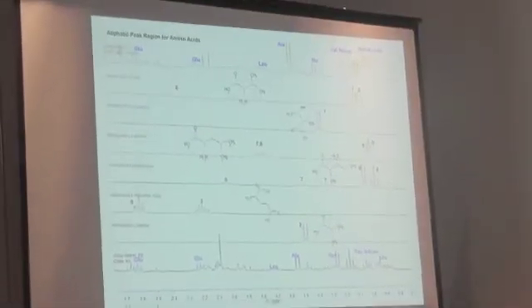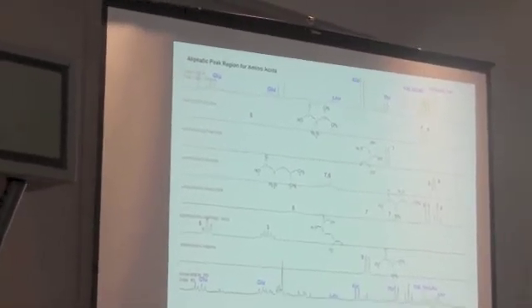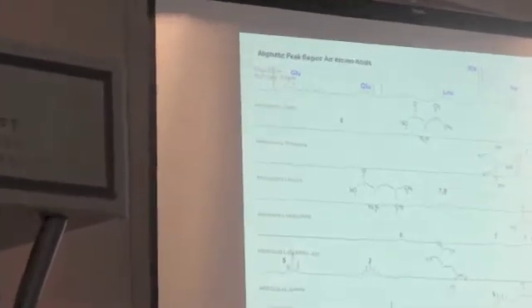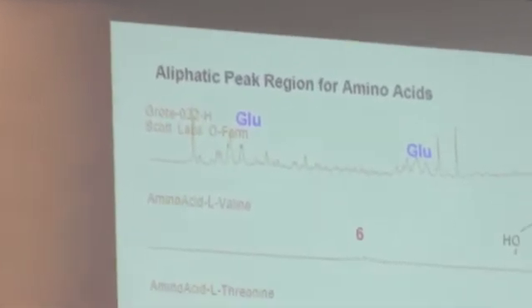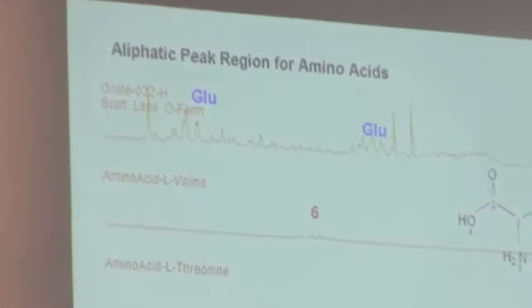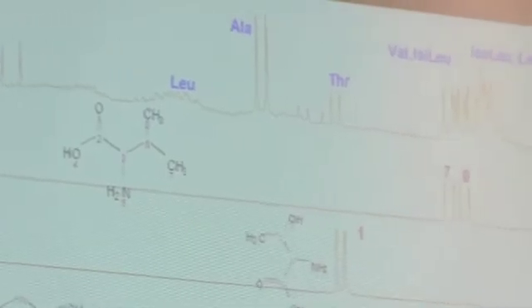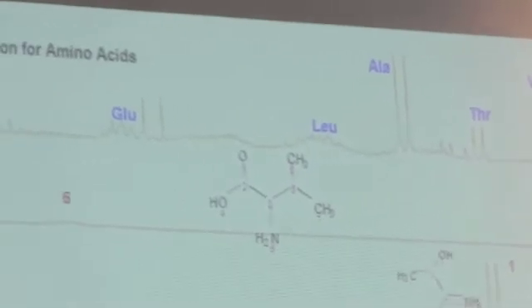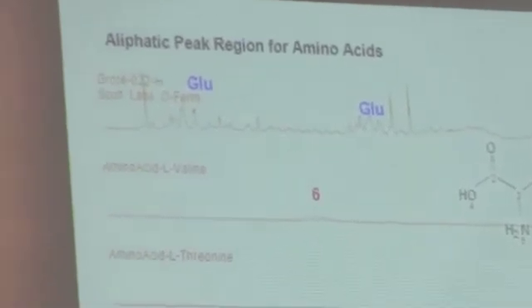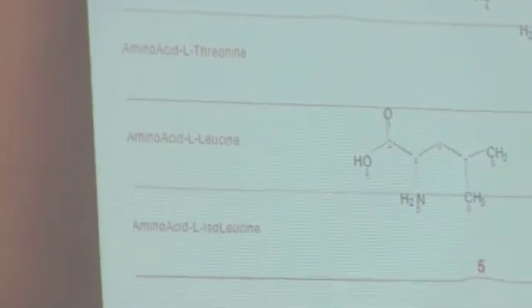The reason I'm showing this is some people are really interested in it, and we totally missed it in the project, because the next sample he sent me was a week down the road. And the yeasty beasties had already grabbed all this and made cell walls with it, or whatever they're doing. And so we didn't see. But if you're really interested in the first couple of days, what are the yeast eating, and what does that mean further down the road? You could do a spectrum every 3 hours or something and see what's disappearing first. Do they have a preference on what they like to eat first?